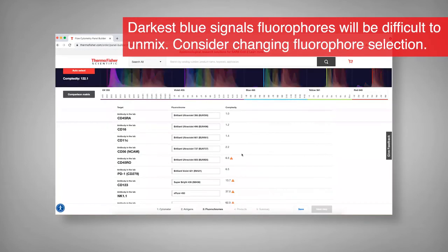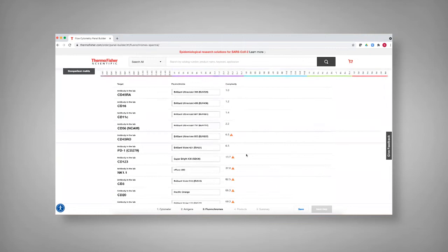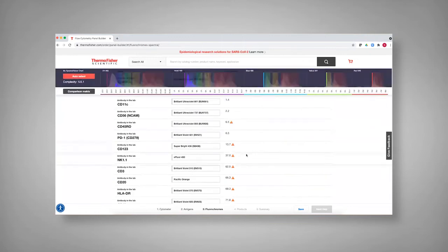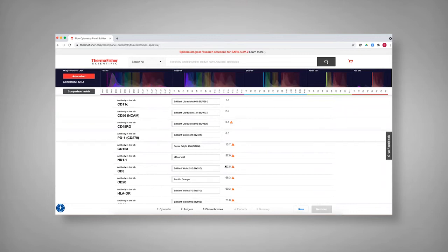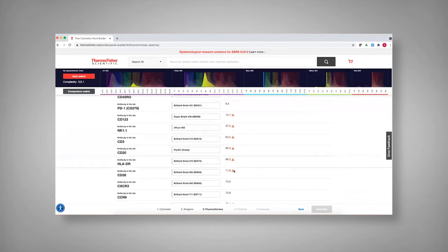Another place that I think is interesting as you go through. This complexity score is just showing you as you built it. So if you put these in a different order, you would see that number increase. So this is sort of where the complexity score is at this particular place.